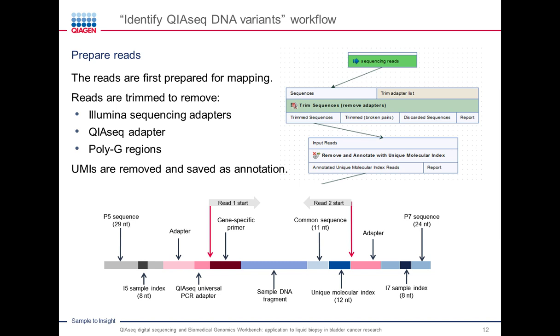And the reason is that all the technology that we use, the sequencers, they all require a number of adapters, primers, and sequences to tag the samples and barcodes, which means that your sequencing data will contain all this information that needs to be removed in order for you to focus on what is important, which is the DNA of your sample. Removing all this information is not simple, and you definitely need a bioinformatics solution which is able to do that.